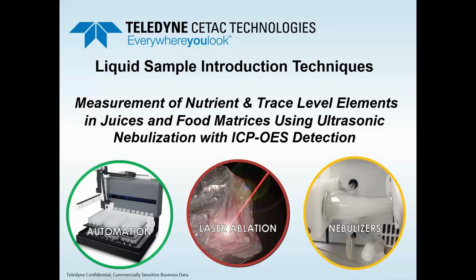Thank you for the introduction, Shelley, and thank you everyone for attending today. Today's webinar is going to discuss a very timely topic, and that's the measurement of nutrient and trace level elements in juices and food products. We are going to explore using an enhanced nebulizer accessory, that is ultrasonic nebulization, and use ICP-OES, optical emission spectroscopy, for the detection of trace and minor elements.